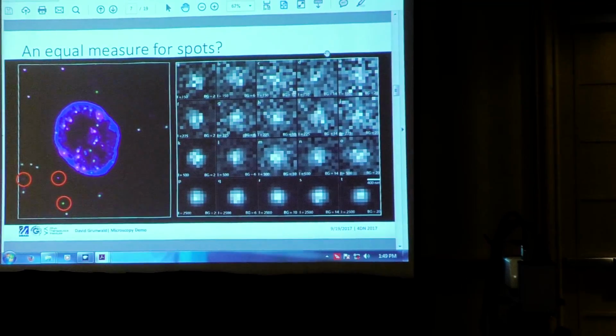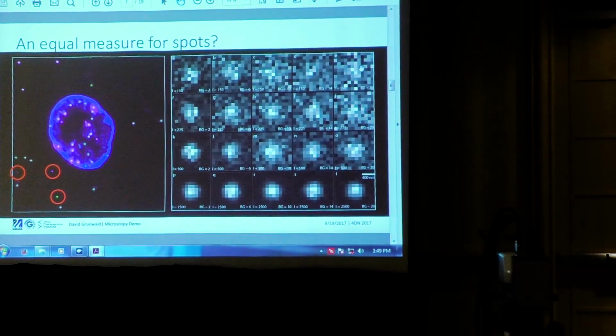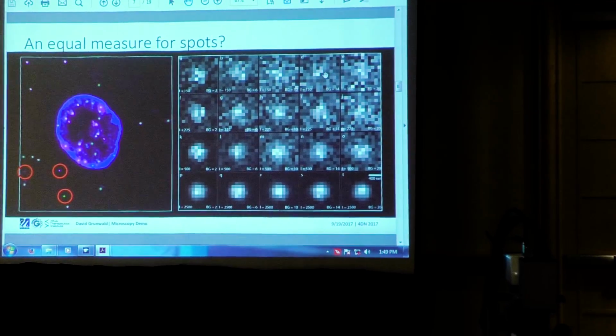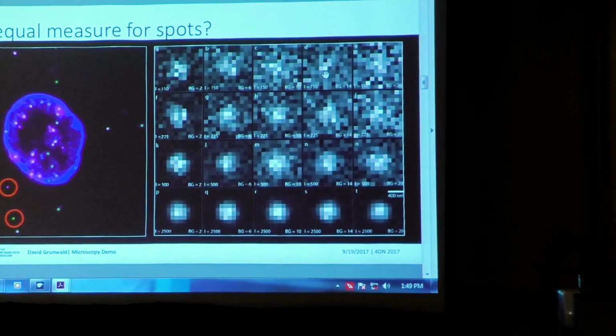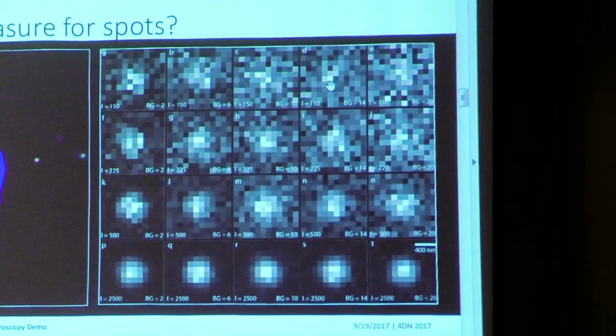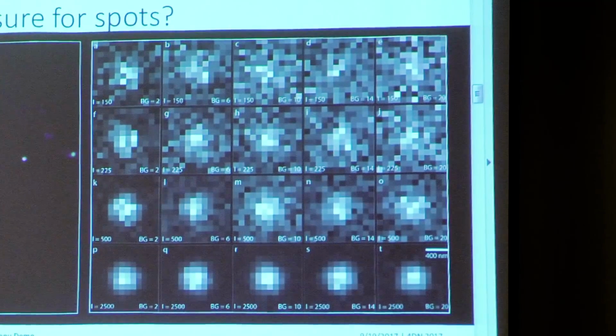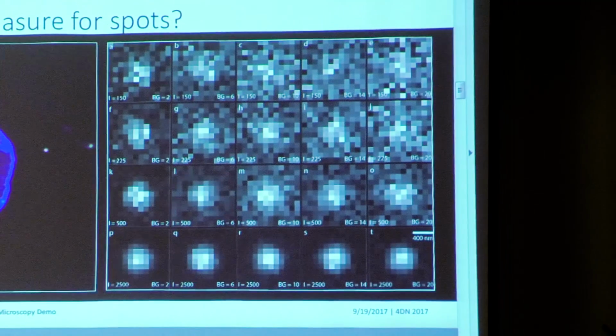It's just a question of signal to noise. It's how much background is there, how does it come above. But at this level, this looks worse to me than that. It does have more photons, less background. So in that sense, what is better is really a question that drives us.